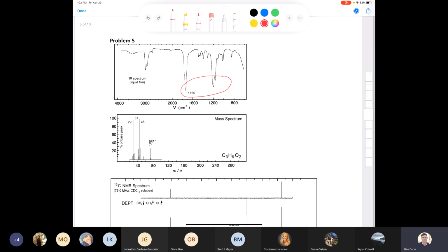Well, if you look at the David Klein chart, and I have it here, if you look at what it says for an ester, it says 1735, you have carbonyl stretching, but then between 1300 and 1000 reciprocal centimeters, you have a carbon-oxygen stretch. The carbon-oxygen stretch being a very strong absorbance, this a lot of the time is a giveaway that you've got an ester. You've got a carbonyl here, and you've got a carbon-oxygen single bond here that probably are a result of an ester being in your compound. So we'll put here an ester present like that.